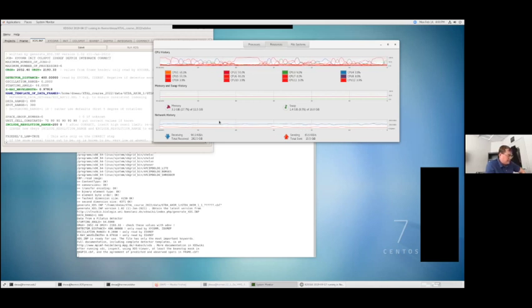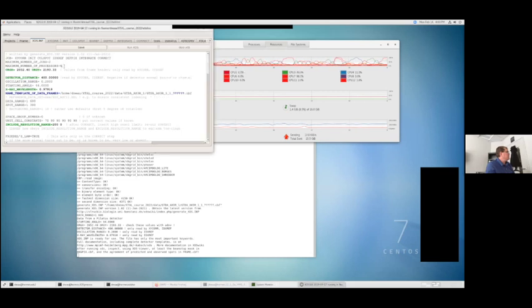And then if I do jobs equal 4 and processors equal 4 on my desktop, I can squeeze that down to 92.9 seconds for integration. But in that case, I'm also maximizing the amount of memory that I'm using. So you got to kind of play around with those parameters to see what works for your hardware. Okay. So normally, if I was just running this, I would put 2 jobs, 6 processors. I'm going to lower the number of processors down to 4, and that's because I'm also running Zoom, which is using some of my memory up. So I don't want to overload the computer.